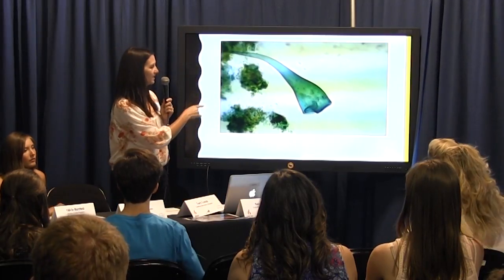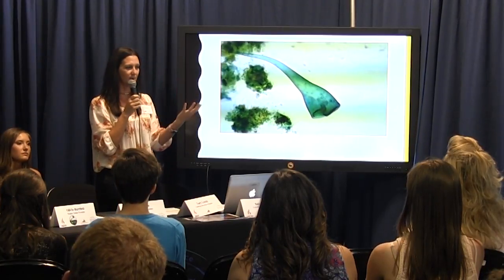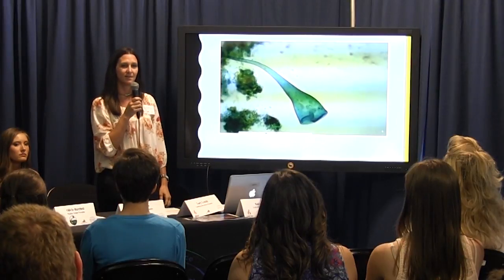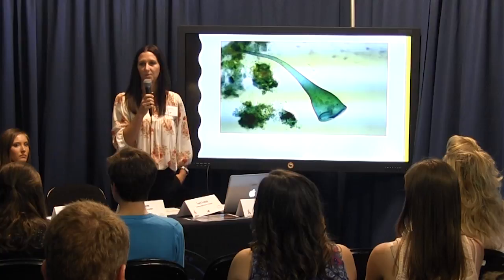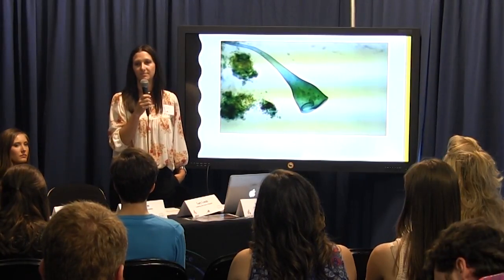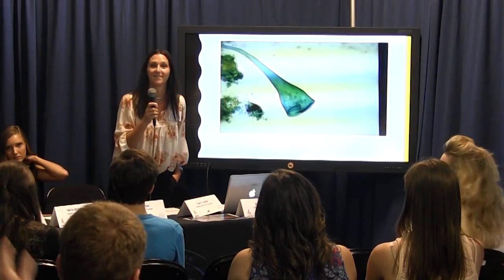And some of these also had other things like rotifers moving around, but basically my activity was using this equipment, these digital microscopes, to better perfect their knowledge and usage of the microscope. Any questions?